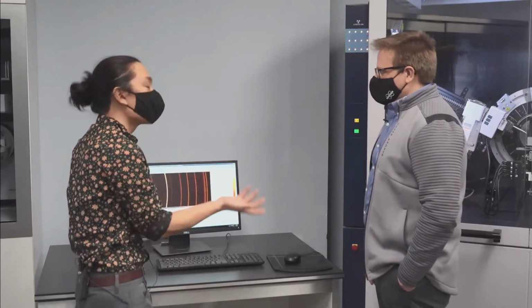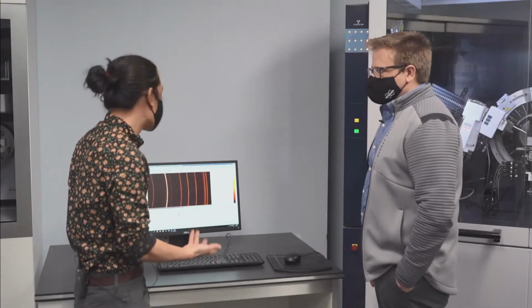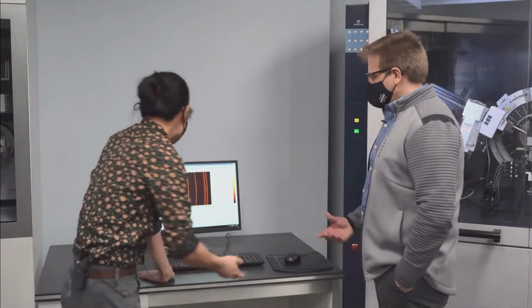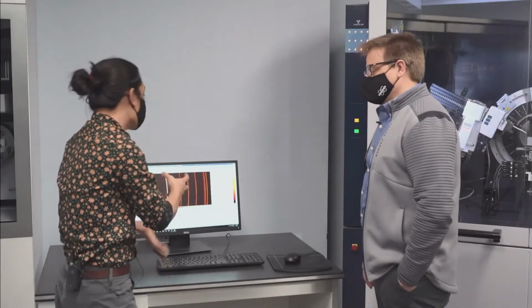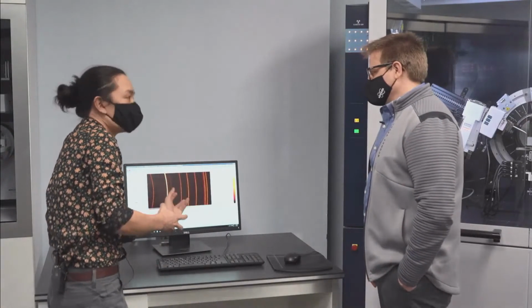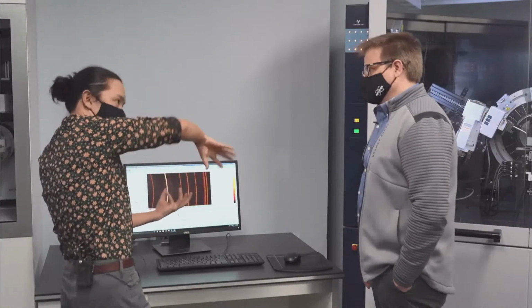Okay, perfect. So we were talking about what if one of your rings is streaky? What if there is some sort of texturing or preferred orientation? Yeah, I had a chunk of metal or something with a lot of texture. And so the way that you would measure this is you would use this cradle to tilt and rotate your sample. And you're actually going to collect the Debye rings as a function of the entire.